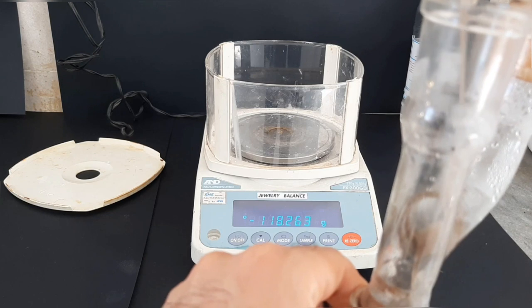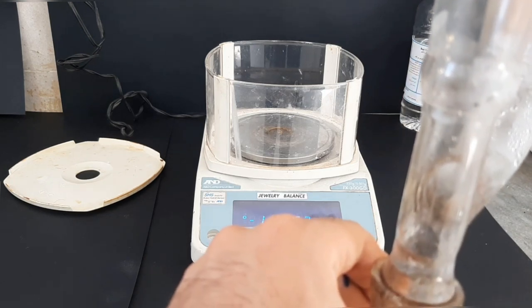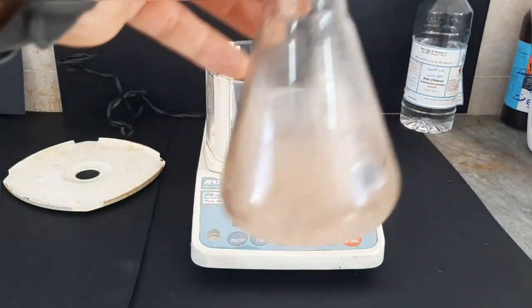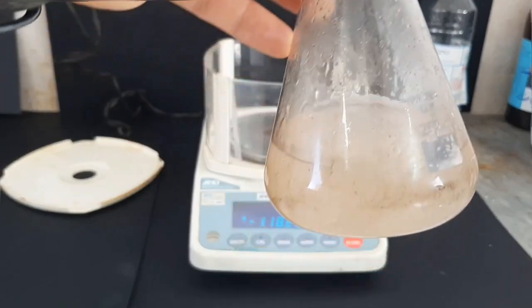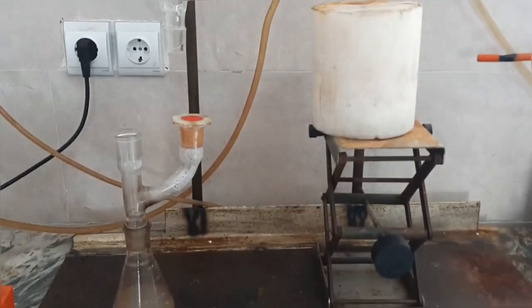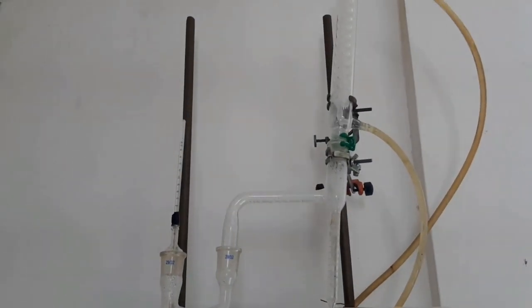So as you can see here, I used an Erlenmeyer flask and a Claisen adapter for my reaction setup. The Claisen adapter lets us add more reagents midway during the reaction if we want to get a more sizable product.